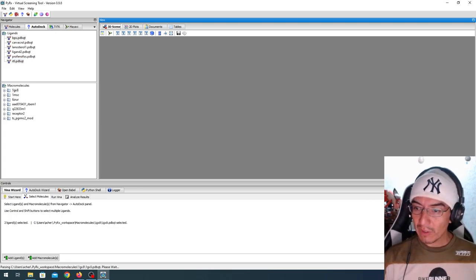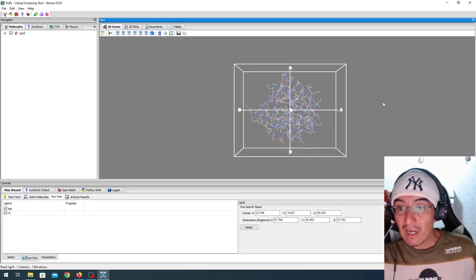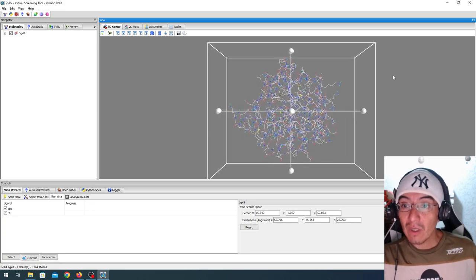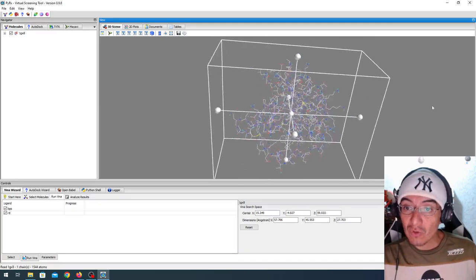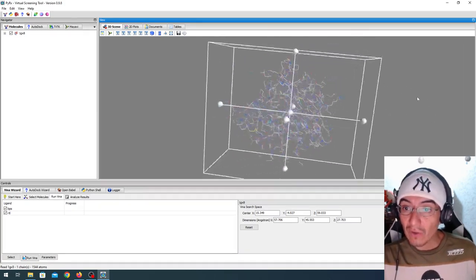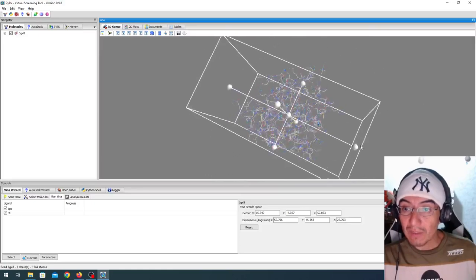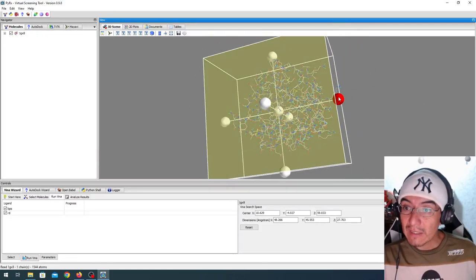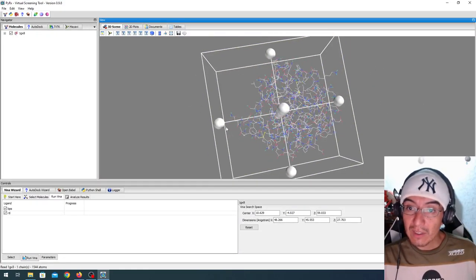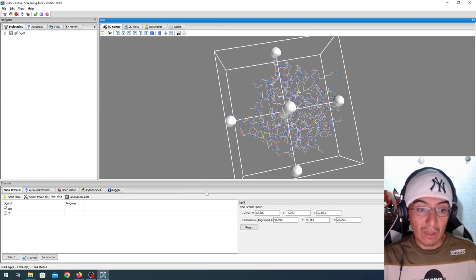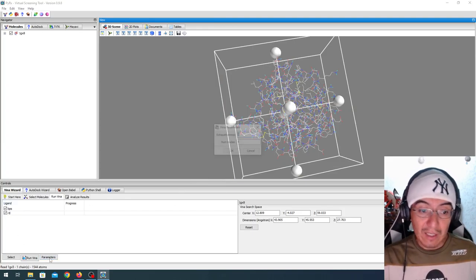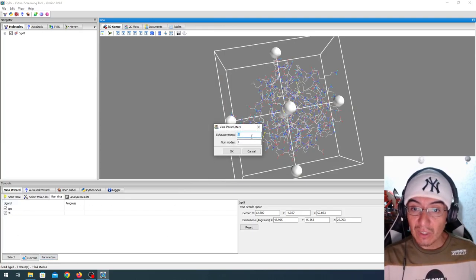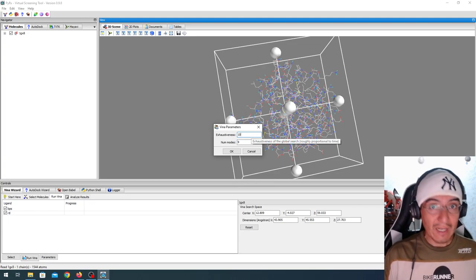This is one of the things I like about PyRx, is that it allows you a lot of control over the parameters of the box. I'm going to make it smaller over here, and here, not a lot. Here we have the ligands ready, and in the parameters, I'm going to change the exhaustiveness to 10.